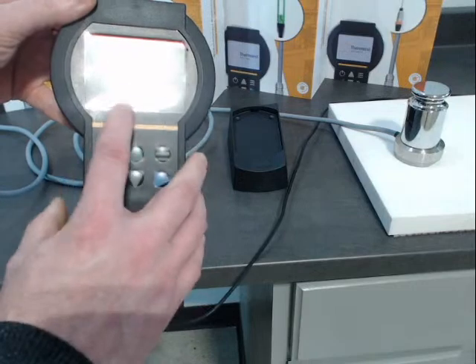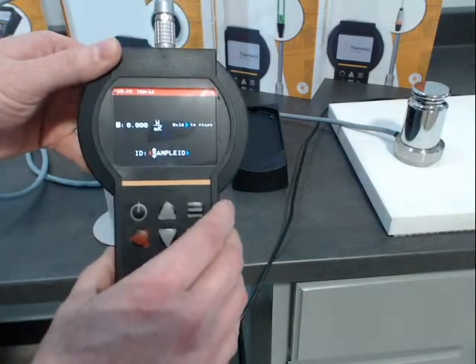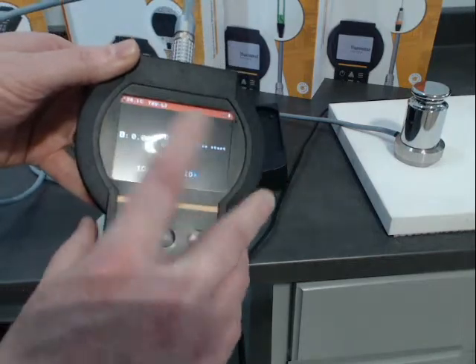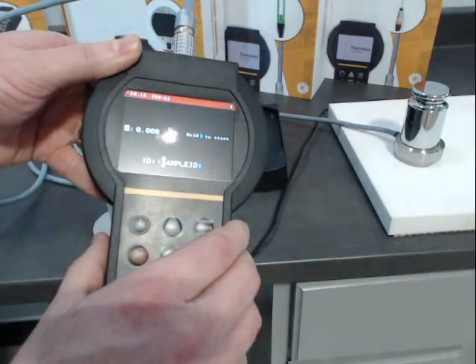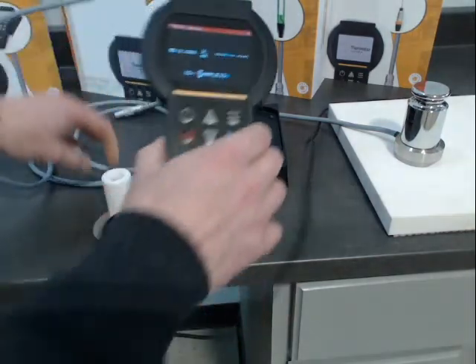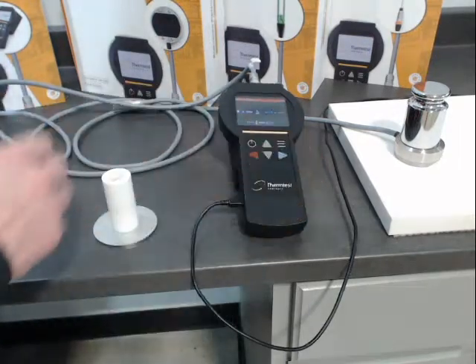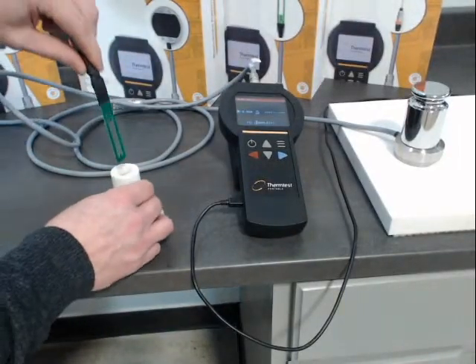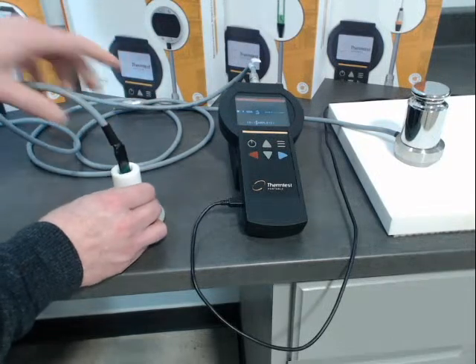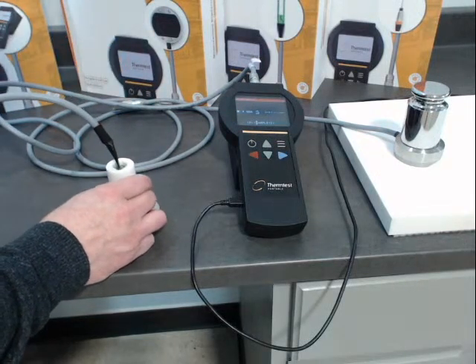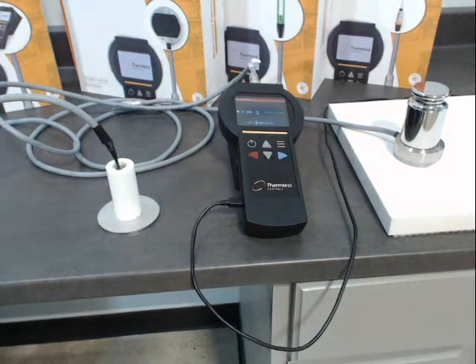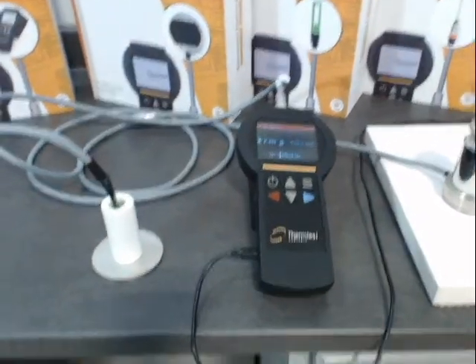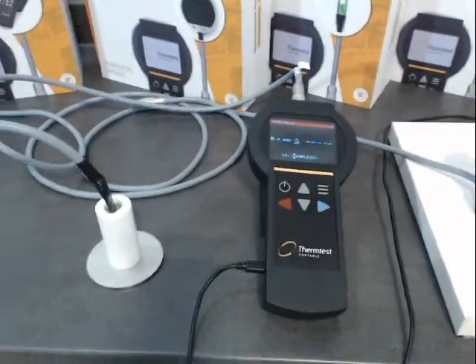Once we plug in the transient hotwire, it will auto-recognize what it is. So now we've reset the ID — obviously it's not the same sample anymore — and now we have THWL3 and the current temperature. I'm going to insert the sensor. We should let this sit for a bit; if you're doing good measurements, you would let everything you touch stabilize, but demonstration-wise we're okay.